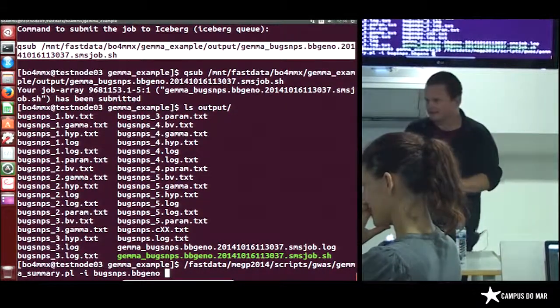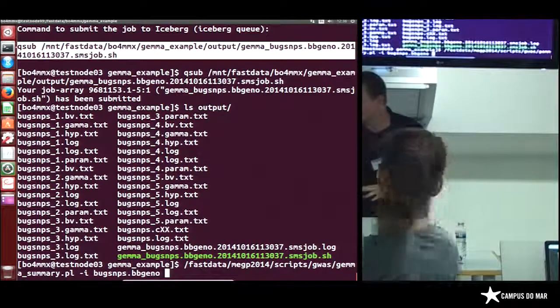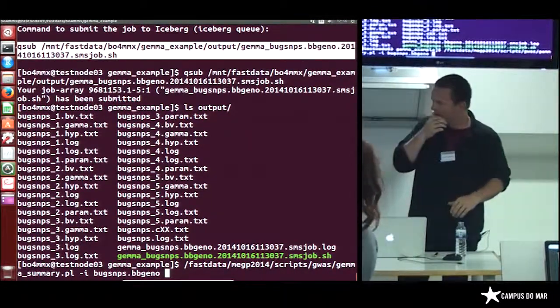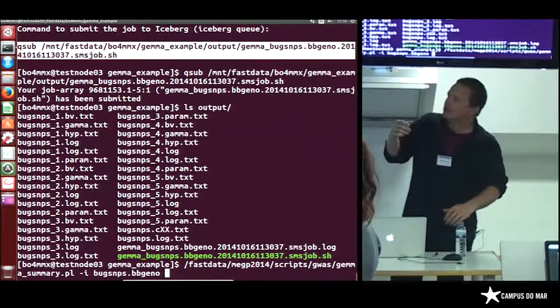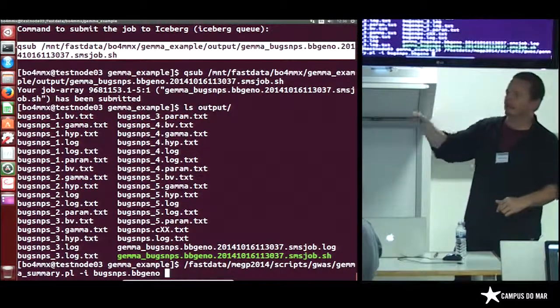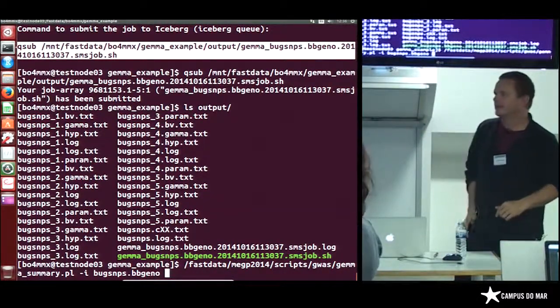Hopefully. So if you don't have access to any scripts that are for a specific server, but just run GWAS as it is, then all of these things can be done. You have to do each one individually. Yeah. But they can be done. I mean, the output we get is a standard output of GWAS.